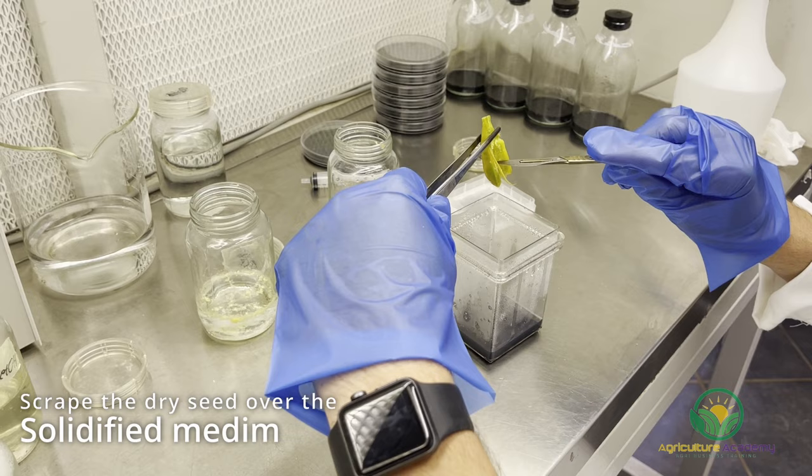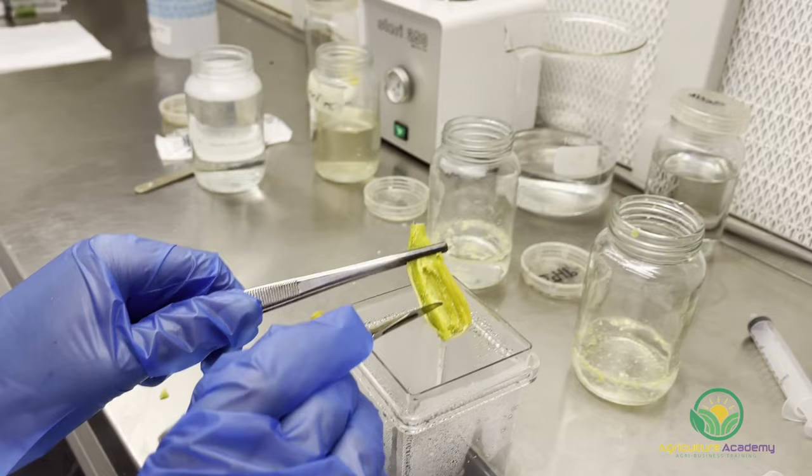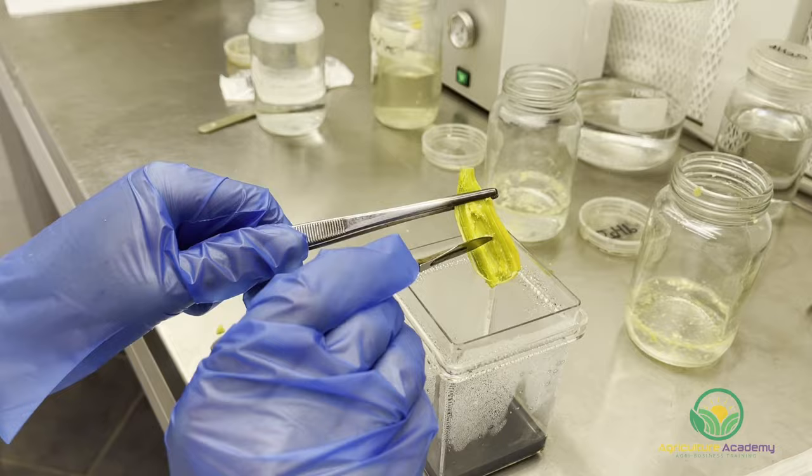To flask dry seed, simply scrape out some of the seed over your solidified medium, trying to spread out the seed as evenly as possible. Before you cut open your pod, you can spray it with ethanol and set it alight for a few seconds, but we found it unnecessary in this case.